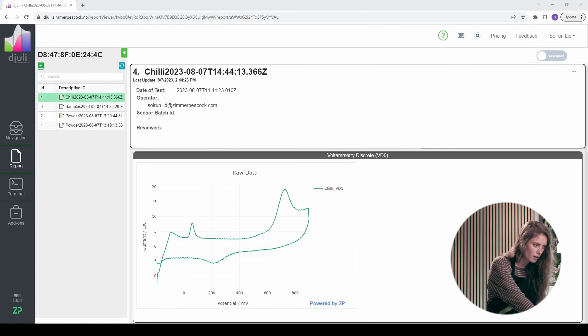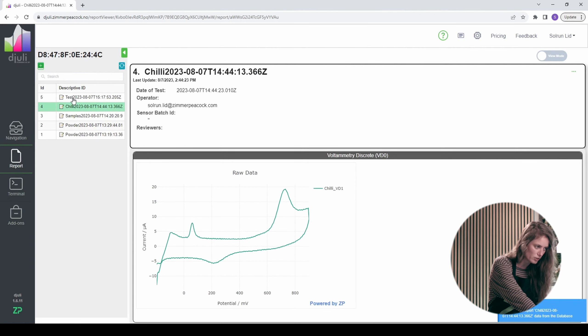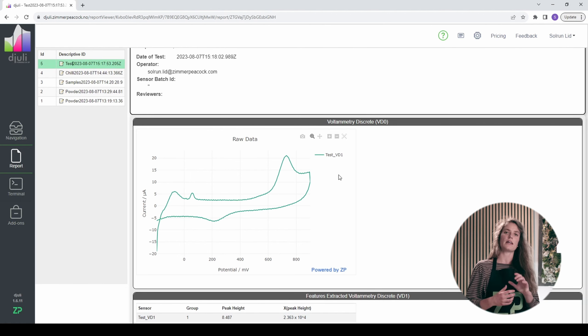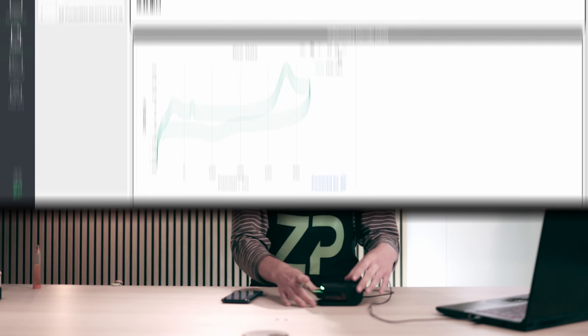I'll go to my djuli account and click refresh so that I can see my data. I called my sample 'test'. Here you can see the raw data with the peaks. These peaks are the ones we use for calculating just how much capsaicin we have in our sample — this is the background or raw data behind the results. Having this device connected to the SenseItAll platform gives you a lot more control over what you're doing, and it's very convenient for scientists especially.